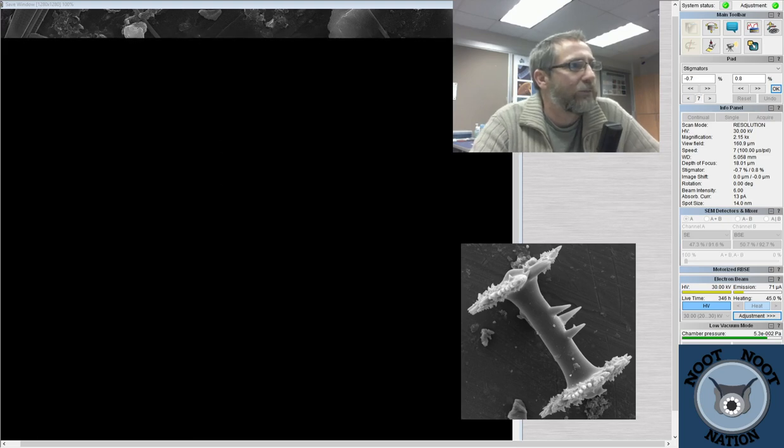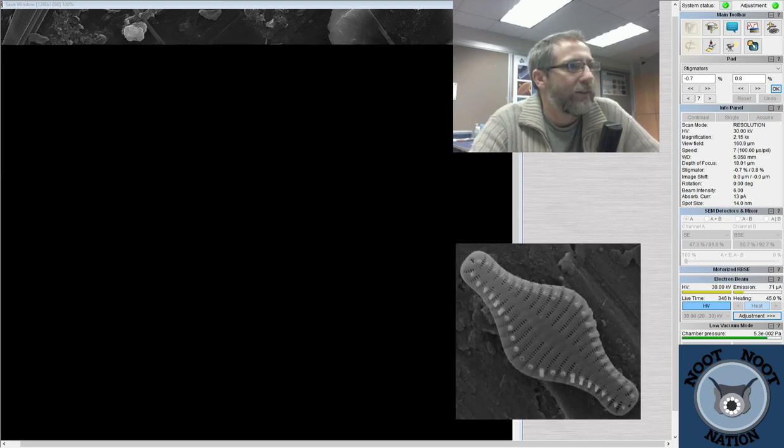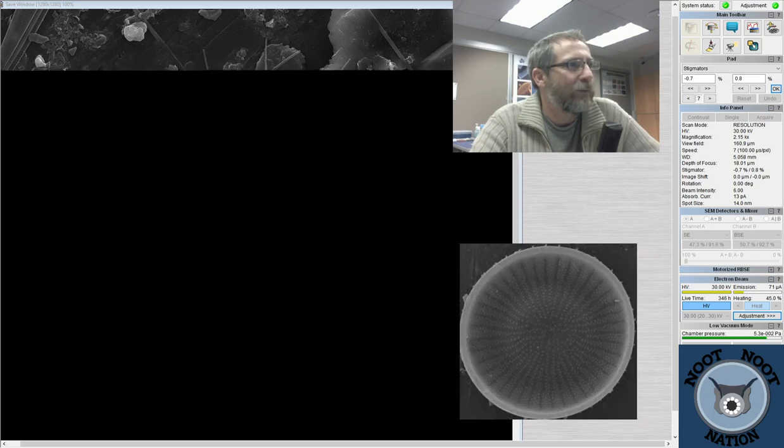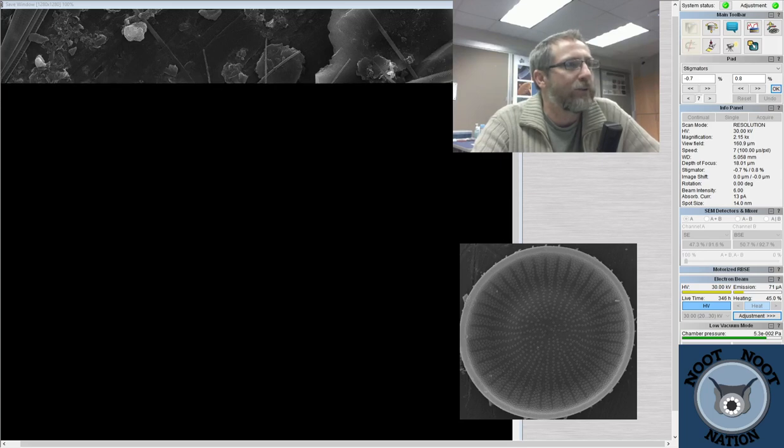So, let's see. Are diatoms multicellular creatures? Bluebird asks. No, they're all single-celled, but some of them kind of act like they're multicellular.